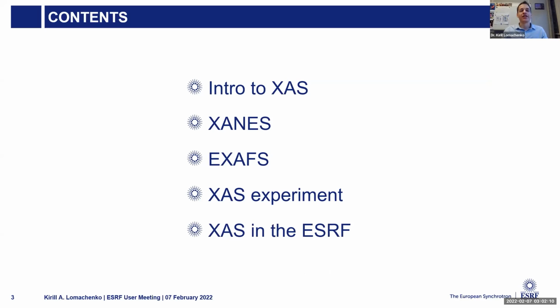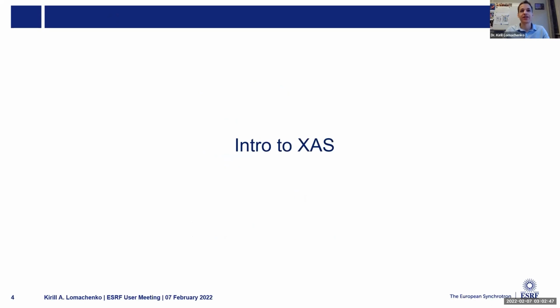And the contents is as follows. I'll present the technique in general. We'll talk about the XANES and EXAFS parts of the big XAS family of techniques, and I'll discuss a little bit the experimental part of XAS, and I will present some of the XAS facilities at the ESRF. Well, some, because there are quite many, so I'll focus on those where I work and what I know best. So, starting the introduction.